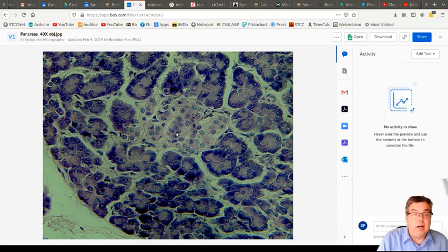But this looks very light because of all the very dark tissue around it. And at the edges of these clusters of exocrine tissue, it gets really dark because this is where those enzymes are gathering to be secreted. And the protein synthesis machinery is there in higher numbers.